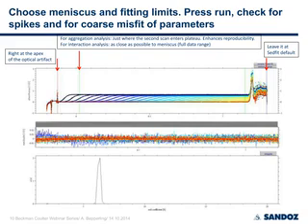Here in between, in this space here, the location of the fitting limit slightly influences the aggregate content you measure afterwards. If you go further into the solution column, it's quite constant. So I prefer for reproducibility to set it here at this position. If you have an interacting system, of course, you want to have it as close to the meniscus as possible to include the full data range.